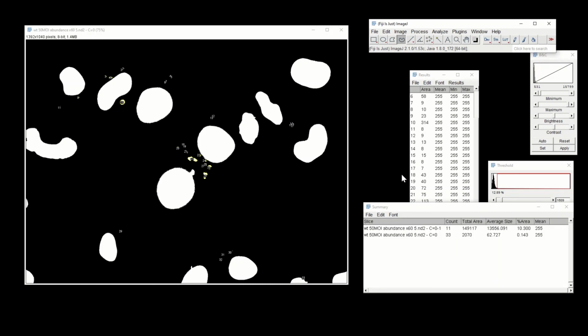In other words, I don't need to sit and quantify or count many different cells. I can develop an algorithm that will automatically count the number of cells in my fields of view. And then I can import an entire folder of images into ImageJ and apply this quantification algorithm to all of the images in this folder. And within minutes, I'll know exactly how many objects of a particular nature I have in my pool of pictures.